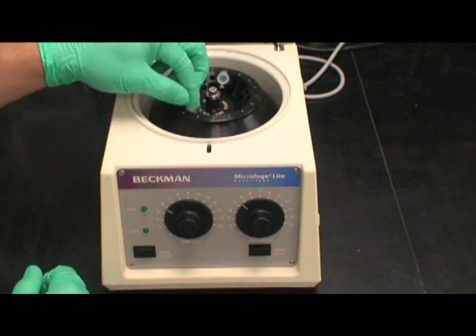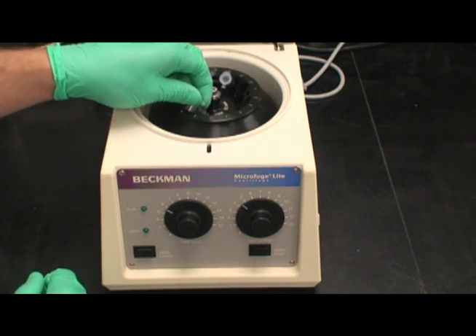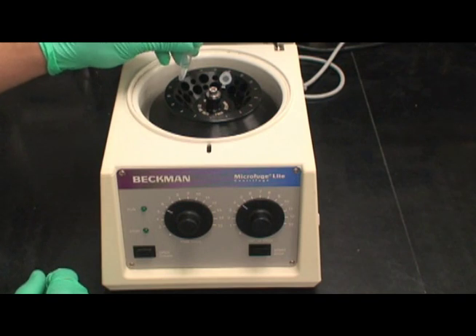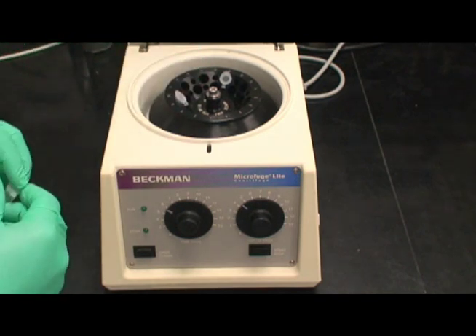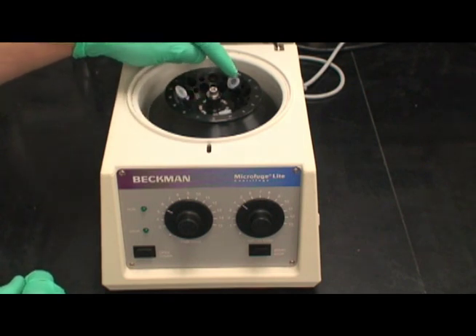This does, however, make balancing more difficult. And in this case, the only way to effectively balance the rotor is by using three identical tubes. Notice that there are two spaces between each tube.